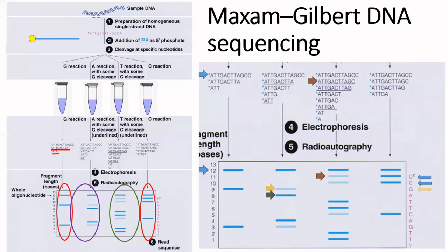So what is that? Yes, we are taking that as an adenine. Likewise, we can read the bands in the whole gel. Finally, the sequence has to be read from the bottom of the gel to the top. There, now you have the sequence of the unknown DNA strand.